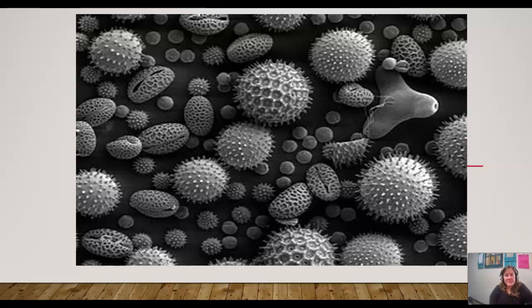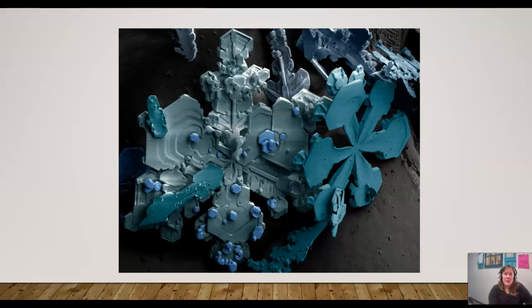After you write down your guess, I will give you an idea that this is pollen. So you wonder what spring allergies and chaos happen inside your nose and sinuses, freaking out. Yeah, these little buggers are in the air a lot in spring and summertime.